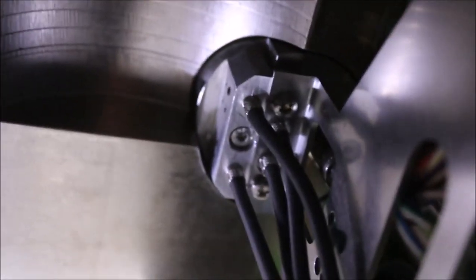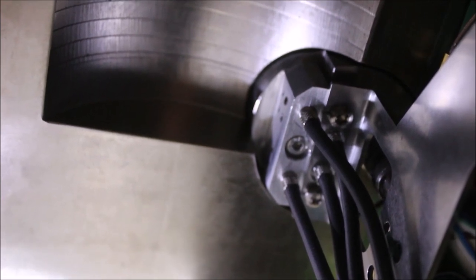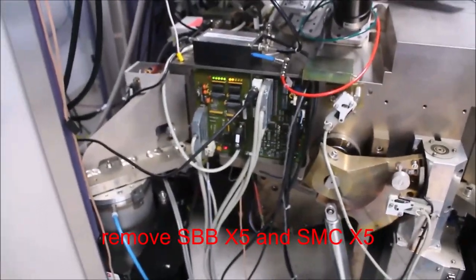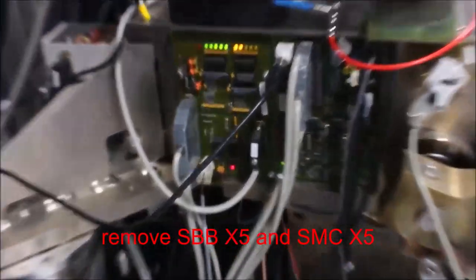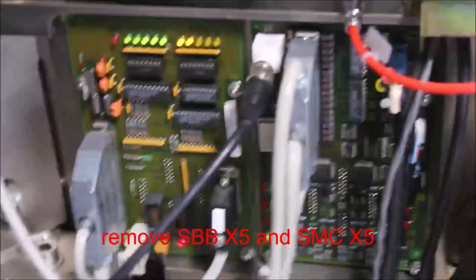One thing we have to do before we can pull out the stage is remove a connector on the inside here. You can see it's attached to a little metal plate with some little tubes. It goes into the ceiling of the chamber. There's one socket head cap screw there. That needs to be removed. On the side there are two connectors, the SBB and the SMC.